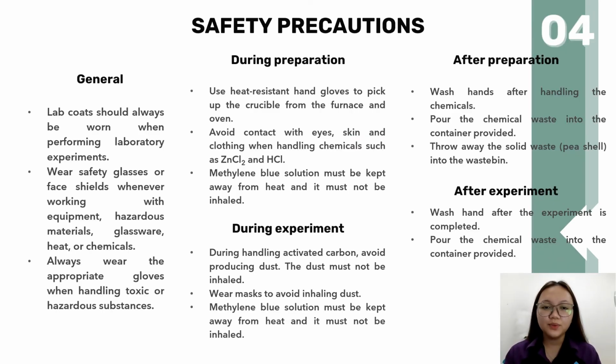For the last part, I'm going to present the safety precautions during and after preparation of methylene blue solution and activated carbon, as well as the adsorption experiment. As usual in the labs, lab coats should always be worn when performing laboratory experiments. Then we must wear safety glasses or face shields whenever working with equipment, hazardous materials, glassware, heat or chemicals. Next, we should also always wear the appropriate gloves when handling toxic or hazardous substances.